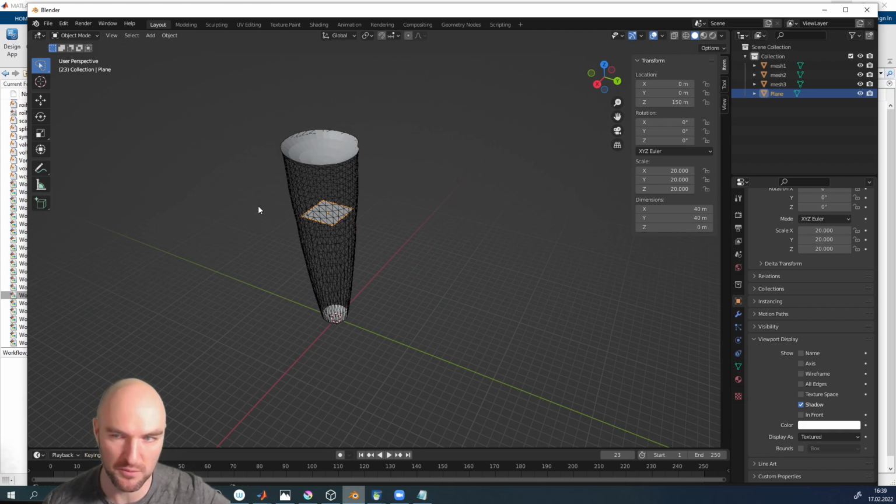But tomorrow we are going to learn how to make more complex objects. Not necessarily with the objective to drive a reconstruction, but with the objective to create analysis objects, and we're going to use those analysis objects to create proximity histograms, for example, from grain boundaries. We're going to use it to do local analysis. So we're going to look a little bit deeper into mesh objects and what we can do with mesh objects in outlining stuff. And then we're going to move to interfacial excess measurements and interfacial excess mapping finally. Okay, and with that, are there any questions?